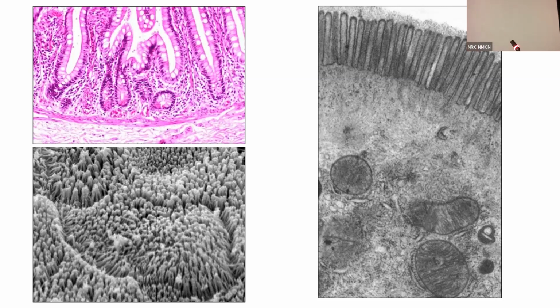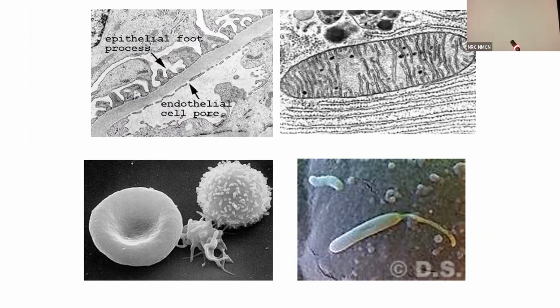In scanning, yes, you can see that you have an actual picture on the photography where you can look at the 3D surface. Absolutely. I'll come to that, but most of the IITs in India, because they deal with a lot of material science, have these high end microscopes which look at these structures, and they are 3D constructions. Okay, now again, which one is scanning and which one is transmission? Just to tell you the concept.